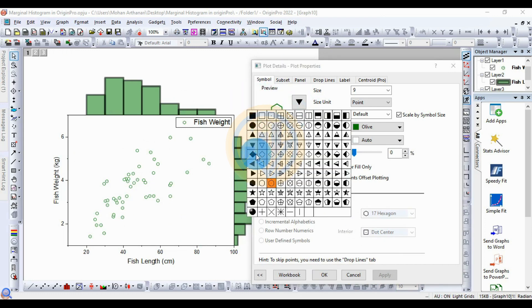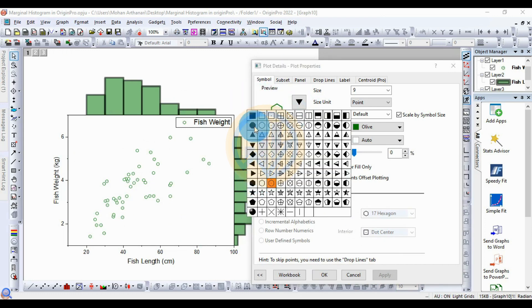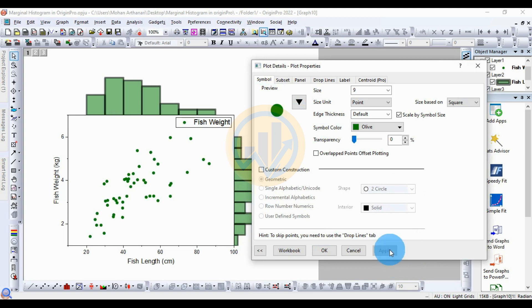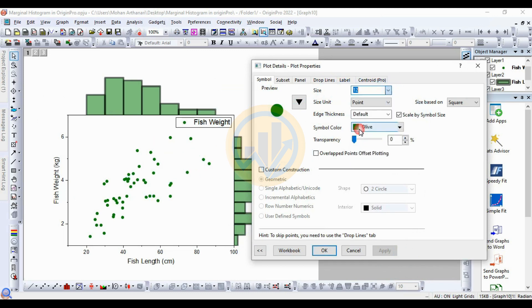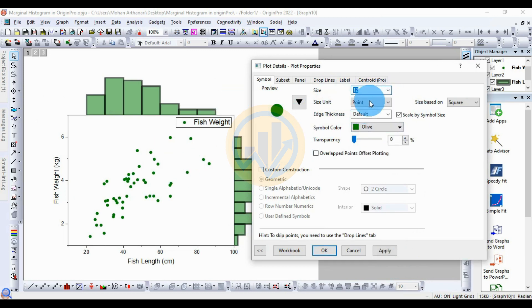I choose the oval symbol shape and click Apply. For the size option, the default is 9. I increase it to 12 and click Apply. The symbol size in the marginal histogram increases accordingly.